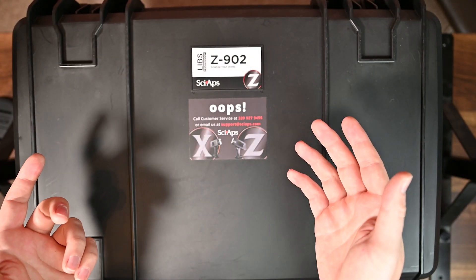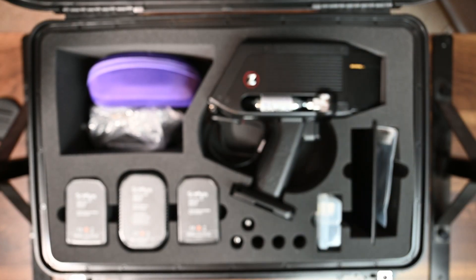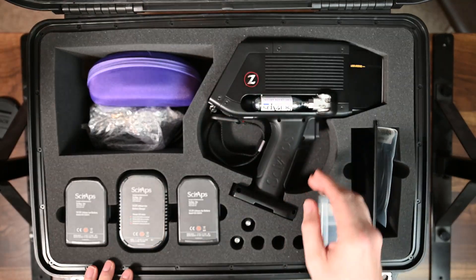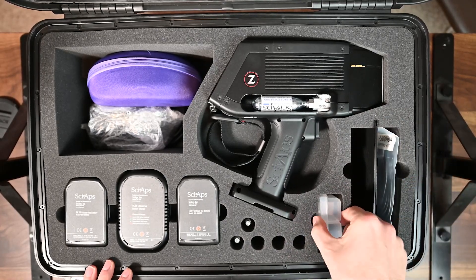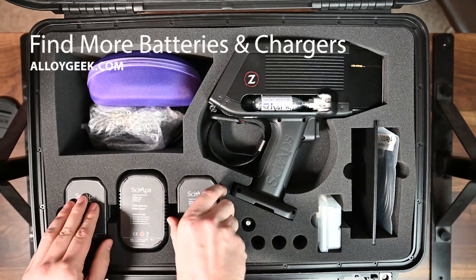Hey guys, welcome back. In this video we're going to take a look at the Z902 handheld LIBS analyzer from SciAps. Let's take a look inside the case. We have our Z902 right here ready to go, down in this corner we have some spare parts we'll talk about those in a bit, and we have a kit for intensity calibrations here which again we'll talk about further.